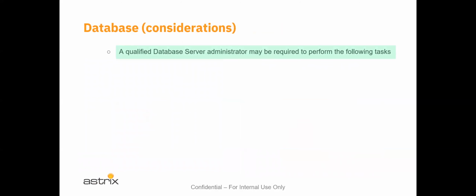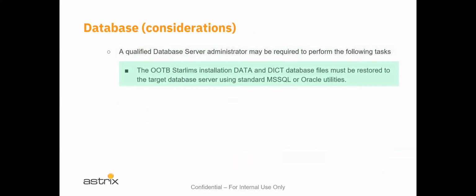So I always recommend that a qualified database server administrator be available to consider installing or configuring anything related to the databases. The out-of-the-box STARLIMS system installation includes a data and dict database files, raw, starter files, if you will, and that has to be installed in order for the STARLIMS system to function at all.